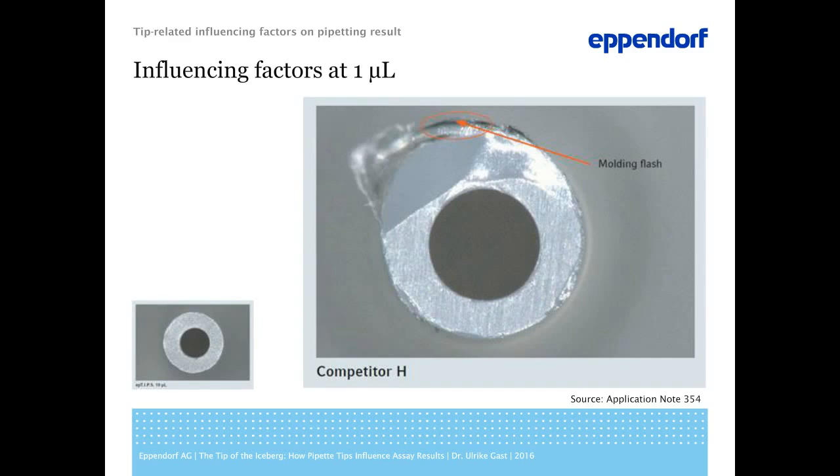This example shows a noticeable core shift. If the walls of a pipette tip have a varying diameter, the water may be deflected to the side of the thinner wall. To speak in pictures, the drop jumps to the outer wall and thus is not part of the dispensing volume anymore. Yes, I'm talking about small drops and liquid remainders here, but since we are talking about very small volume, this already counts. In general, you can say that the smaller the volume, the more important a perfect geometry of the tip orifice becomes.